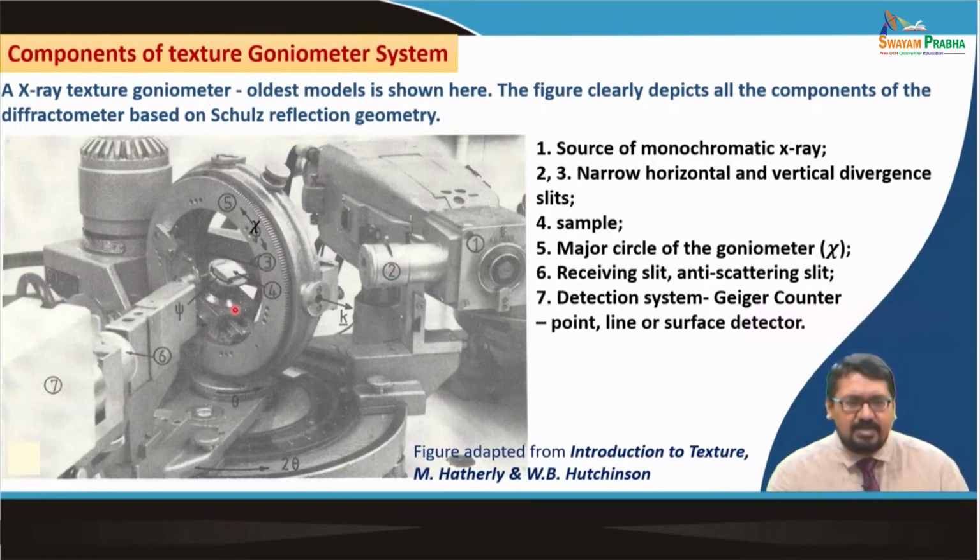The figure can be used to clearly depict all the components in this diffractometer, and this is a diffractometer based on reflection mode, that is, the Schulz diffraction method.